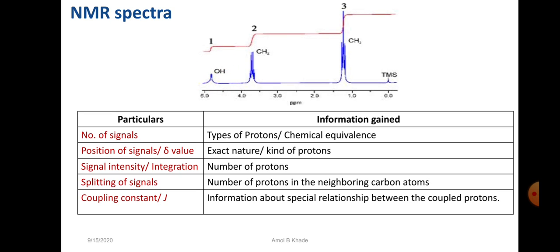Now, taking the NMR spectrum gives a lot of information about the structure of a particular compound, and this makes the NMR spectrum a very powerful tool for elucidation of structures, usually novel structures. In proton NMR as well as C13 NMR, we record the chemical shift values for a particular set of protons with respect to a reference standard, called the internal standard because it is added along with the sample, that is TMS.